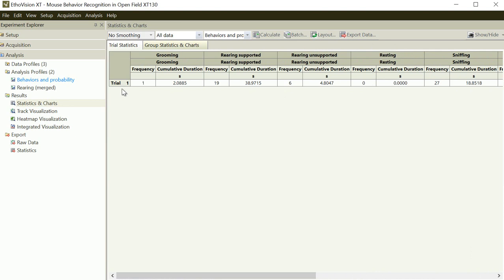And if you acquired many trials, many numbers of animals, the list will be added like this, and it is quite a time-consuming task to calculate all of them. So the final purpose of your experiment project is just to compare the control and treatment. Do you remember that?